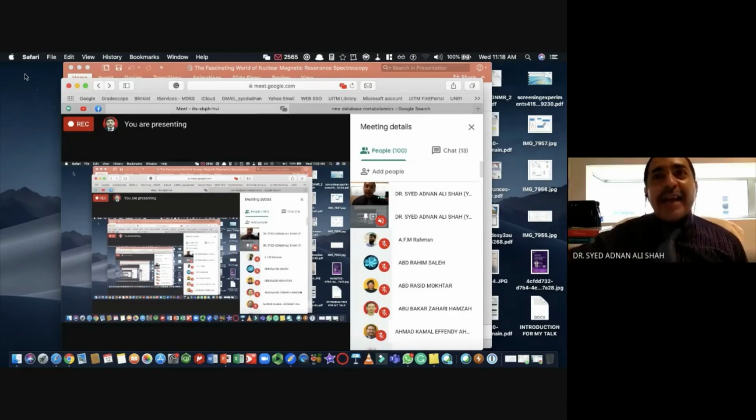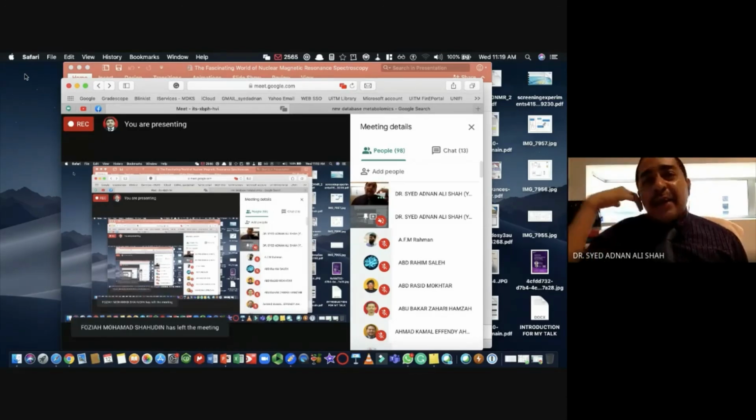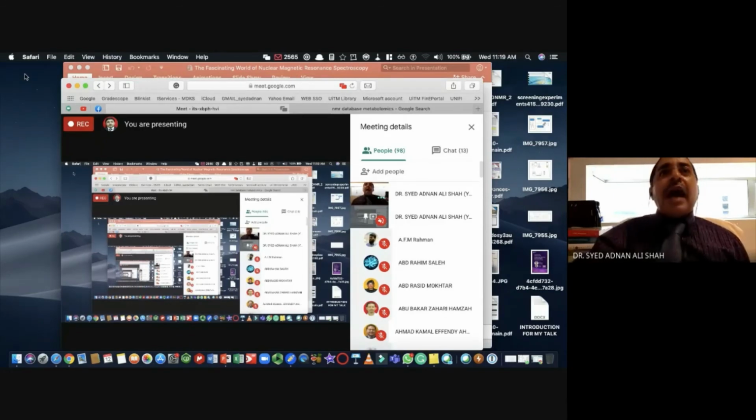RNA is composed of two parts, right? Number one is ribose sugar. Number two is the nucleobases. So the bases are adenine, cytosine, guanine, and uracil. All have hydrogen, all have N15. Label the RNA with N15, and then you can run the sample and get the information about the nuclei, meaning hydrogen nuclei, right? Meaning atom nuclei. Of course, RNA is composed of all the atoms, hydrogen, nitrogen, and all atoms are composed of nuclei. This is the best tool for the analysis of RNA.